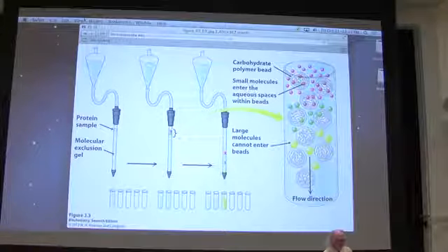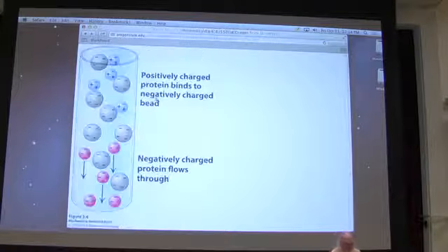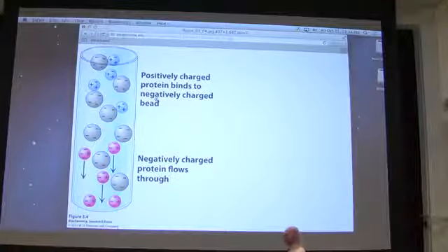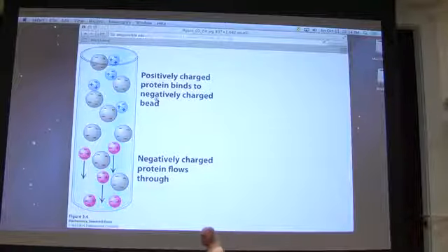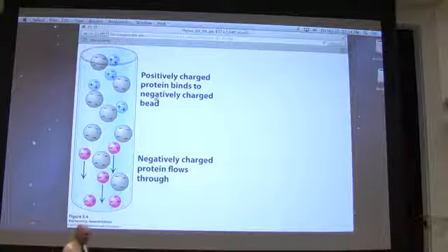Okay. So that's gel filtration, gel exclusion chromatography. I want to tell you about another technique that we use that actually relates to something we've been talking about in class so far. This is called ion exchange chromatography. And you can understand it pretty simply, all right? But I'll describe it to you.